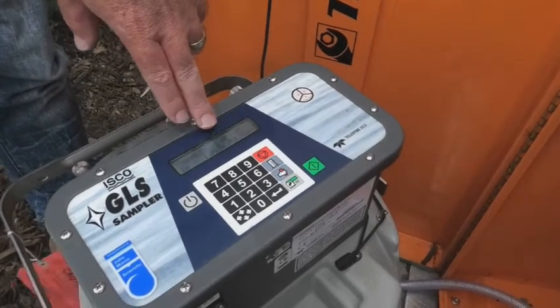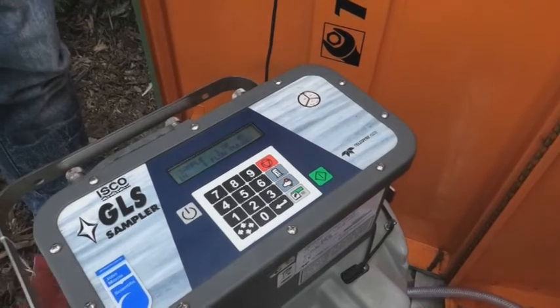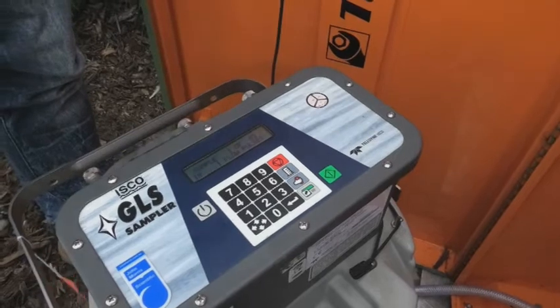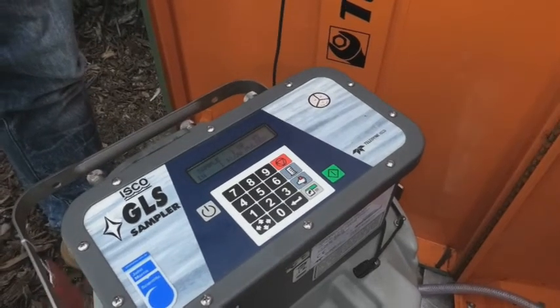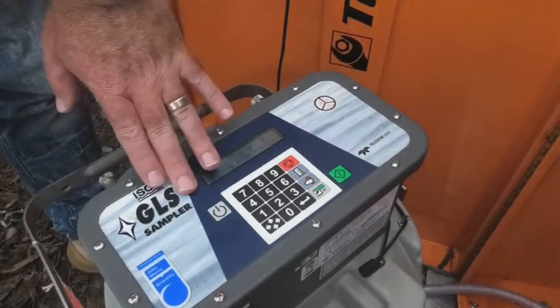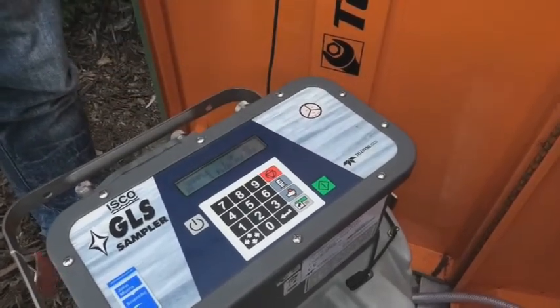If you don't see one of however many samples — in this case 45 — it's still in standby. So you need to actually press that green button, otherwise everything else will work and the sampler won't. So you need to just double check that it does say sample one of — in this case 45 samples.